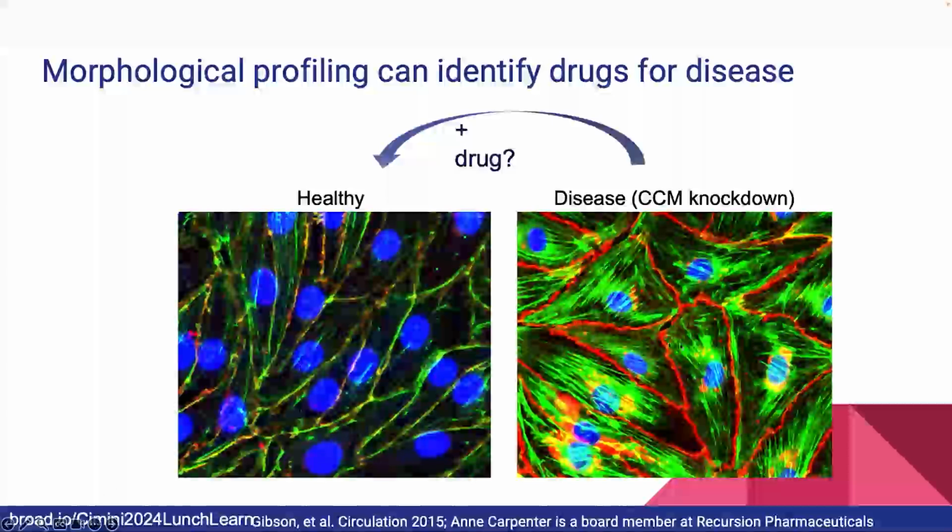These cells are different in a lot of different ways. You know, things like the shape and things like where this green, I don't even know what's staining green here, is, but we don't pick up on the right one, whatever it is. And so the mice do much better when you give them drugs that were picked out by the computer saying the cell looks healthy.